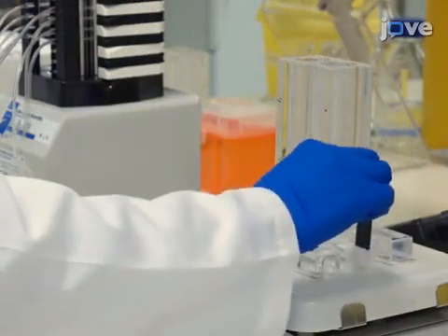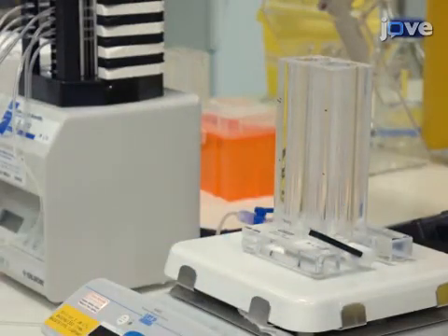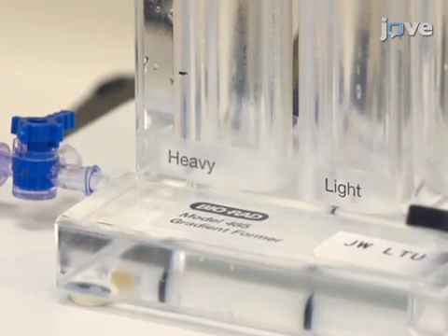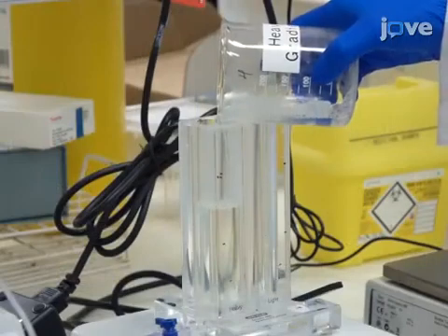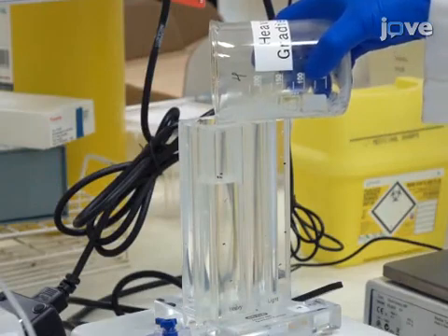Then turn the black lever down to close the connection between the inner and outer chambers. Place the gradient pour with a magnetic stir bar inside the inner chamber on a magnetic stirrer. Then pour 35 milliliters of heavy gradient solution into the inner chamber.